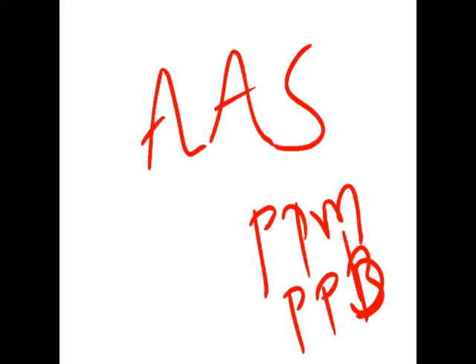Okay, so this is the introduction part regarding atomic absorption spectroscopy. First, it is utilized for the detection of elements; more than 70 elements we can determine. Second, it is sensitive, so parts per million or parts per billion concentrations of the sample can be analyzed. Third and more important, in the presence of one or two other elements, we can analyze the required element. So these are the introductory points regarding atomic absorption spectroscopy.